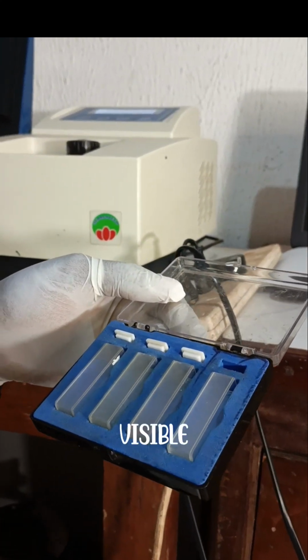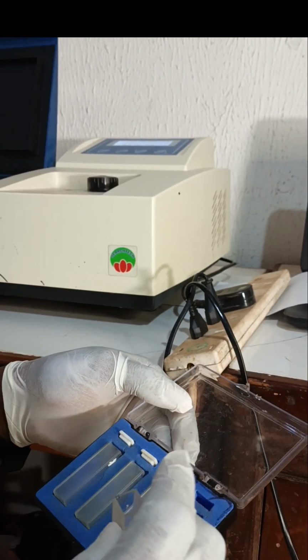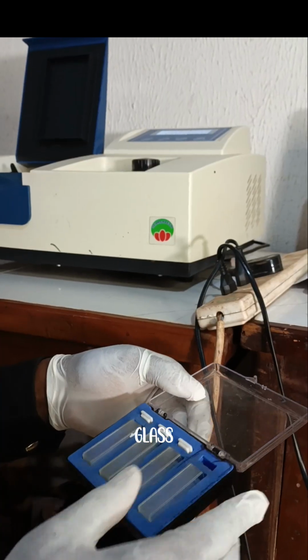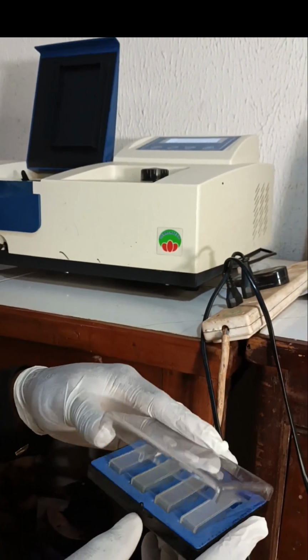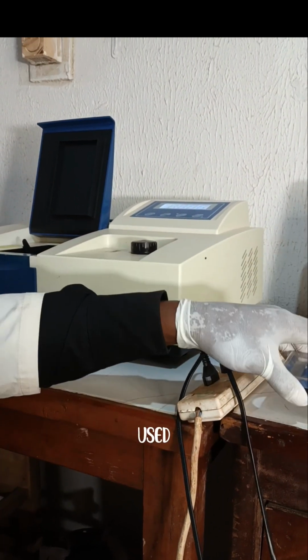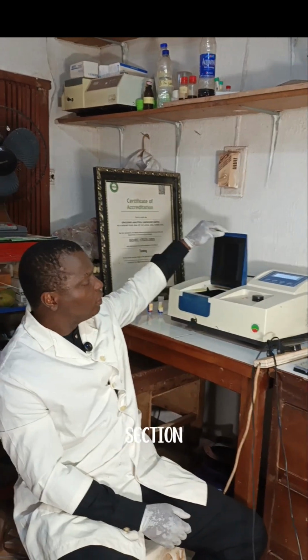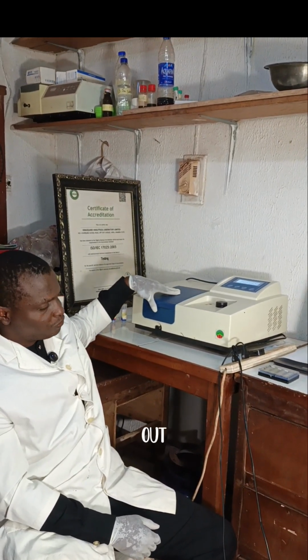In the UV visible spectrophotometer, there are two different types of cuvettes being used, the glass cuvette and the quartz cuvette. The glass cuvette is used in the visible region, whereas the quartz cuvette is used in the UV region. The UV region does not use a glass cuvette because glass absorbs in that particular region of the spectrum. Now, as well, we have the detector section and we have the readout.